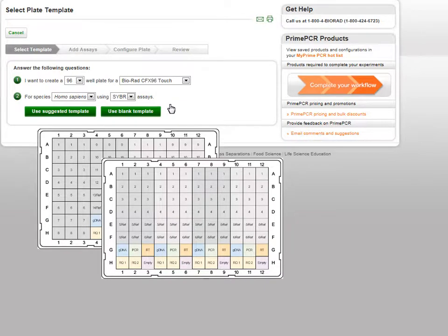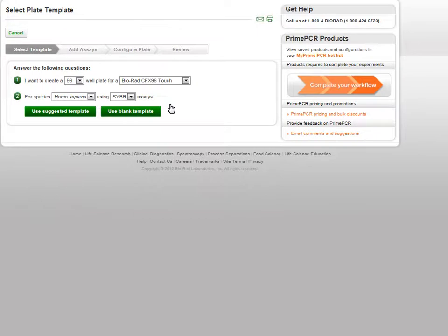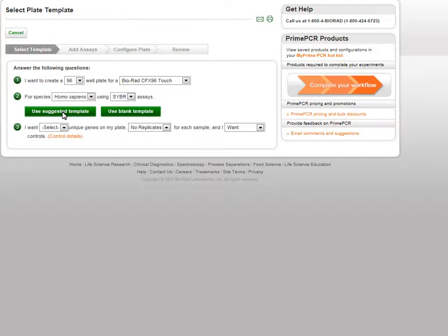A blank template can be selected instead. Clicking the Use Suggested Template button will present a third set of questions.